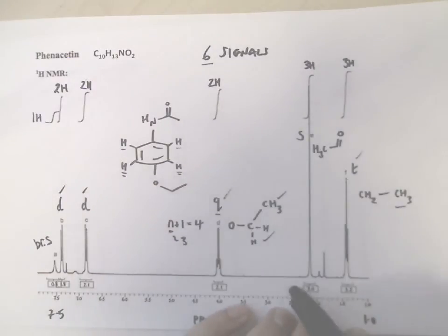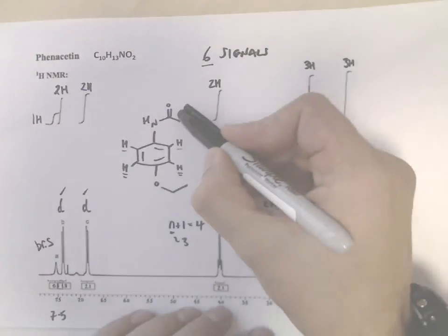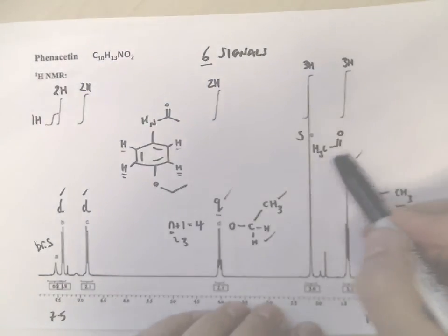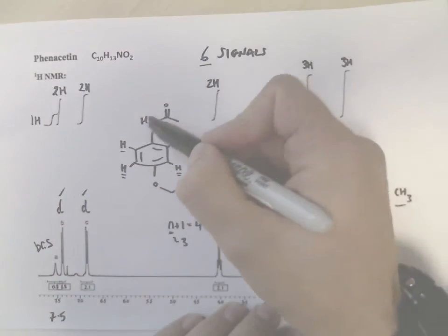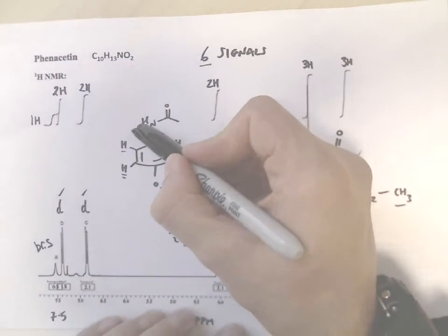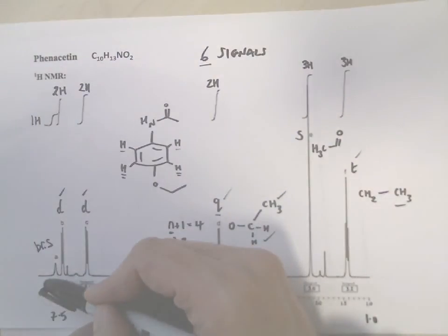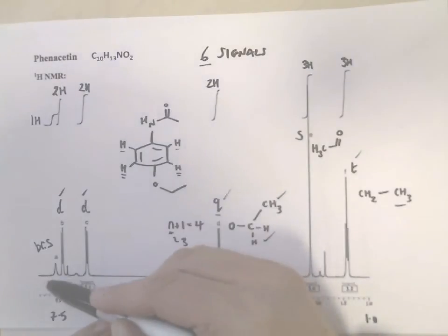Then we have our CH3, which is a singlet, notice, so it has no neighbours. It's also in the right place for a methyl group attached to an sp2 centre. And then finally we have an NH, and we have this proton here, and we also have a proton far down here which integrates to 1 proton. Now this bit is a little bit ambiguous.